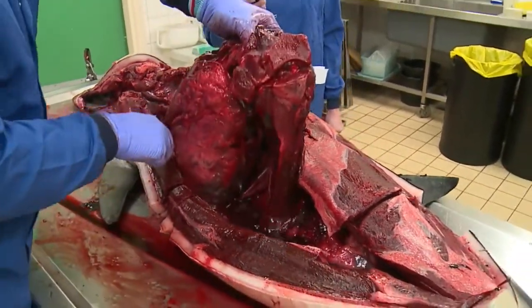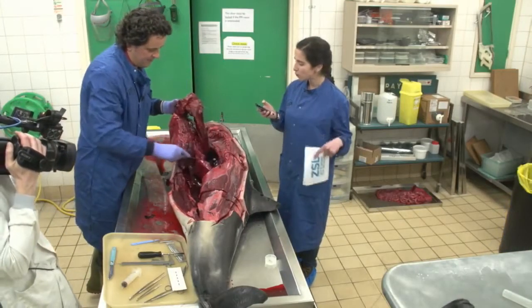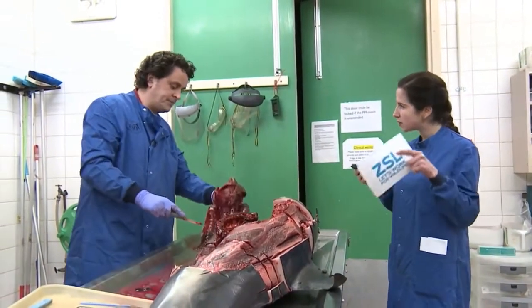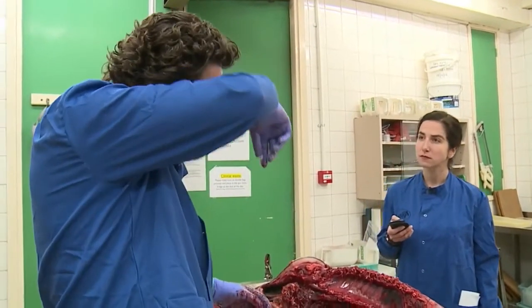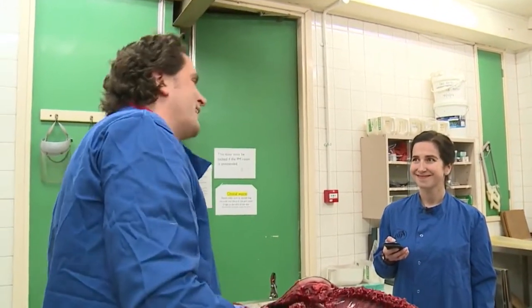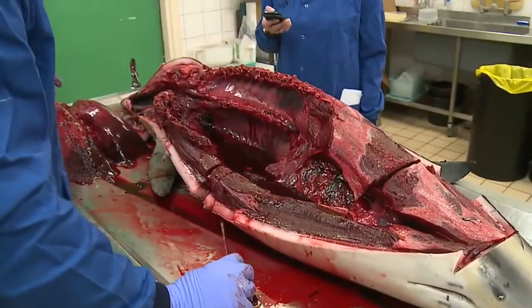I've also got a question from Daja on email, asking if there's an order for the organs which you examine and take samples from. Do you try to be quite systematic about it? Yeah, very much so. It is a very methodical process. It's quite a forensic process. So it might seem like we're cowboys, but it's just impressions really. So yeah, we're just going through this methodically, taking samples as we go.